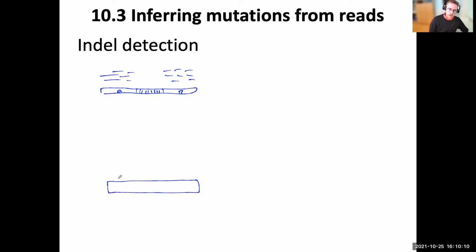If we take our sequence reads, our sample will actually look like this, A and B here, which means that we'll have reads that span A and B, and they'll have a particular insert size length. Whereas when we map the reads to the reference, that particular read would be located here, and then a long, long way to its partner over here.